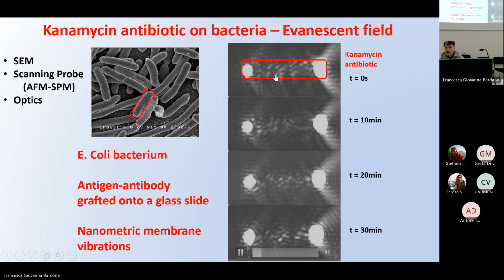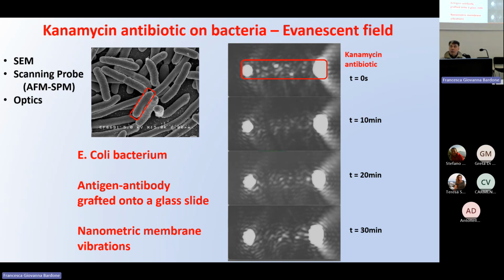So you see, this is the vibration, the interaction of the membrane with the light, which vibrates, and the system detects the vibration. If you apply the antibiotic, after 30 minutes you have completely removed any vibration from the surface. So this was just an example of how you can use microscopy to verify the functionality of an antibiotic, just by planning a specific experiment.